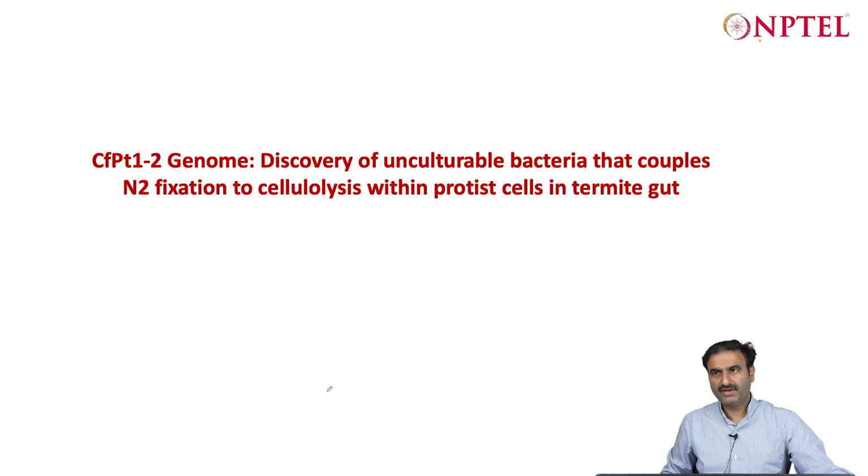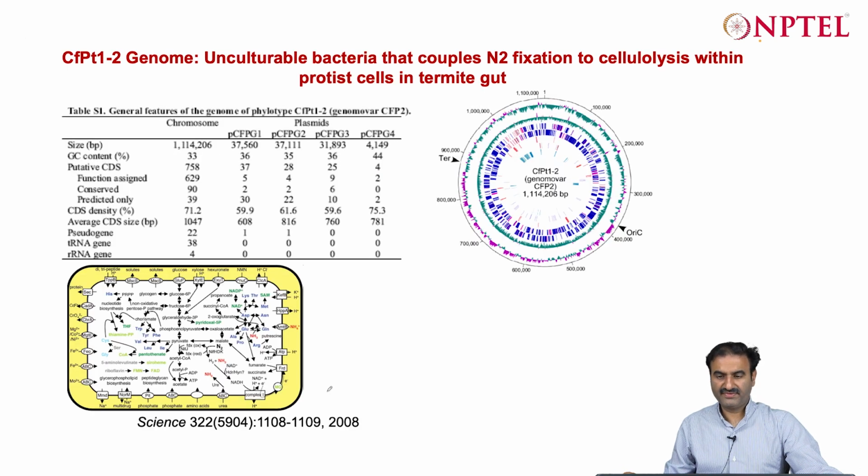Okay, another bacteria which was also abundant was also captured using a single cell genomics method by the micromanipulator, and that is analyzed. After the genome construction and annotation, the researchers found that this bacteria contains the genes to actually fix the environmental nitrogen, and also this bacteria is helping in recycling the nitrogenous compounds inside the bacteria.